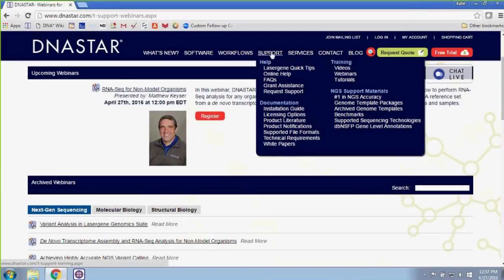And then in addition, from our support menu, you'll see we have all kinds of resources from online help, written tutorials, FAQs, as well as shorter 2 to 3 minute videos. So if you want to learn about any other features of our software or get a little bit more in-depth view of some of the things Matt showed today, those are great resources for you.